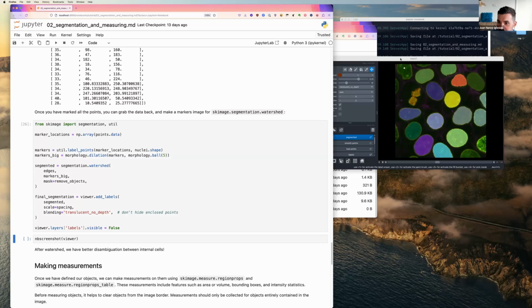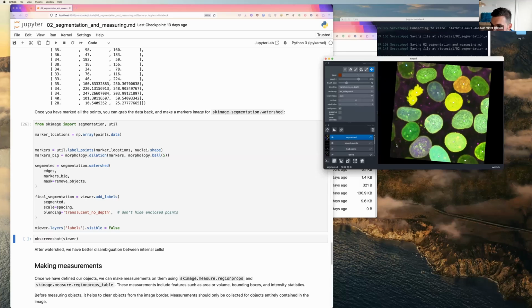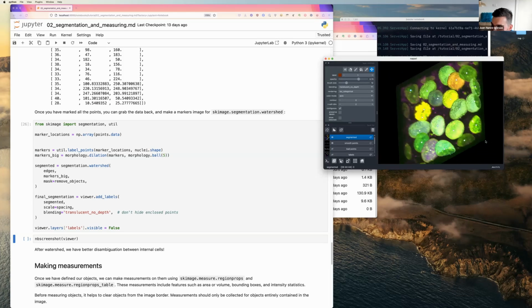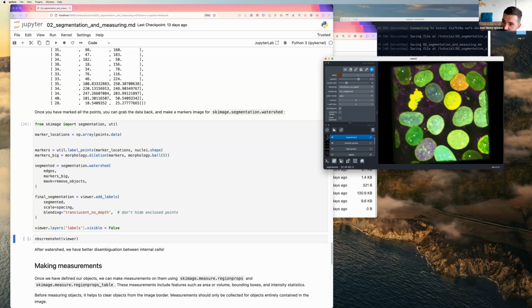Okay, so this is now our segmentation. Let's get rid of, I don't know what we need to get rid of. That particular one has been wiped out, and I won't explain why. But these are all of the, oh, that's right. So these are all of the nuclei that don't touch the top or bottom surface. I think something along those lines.